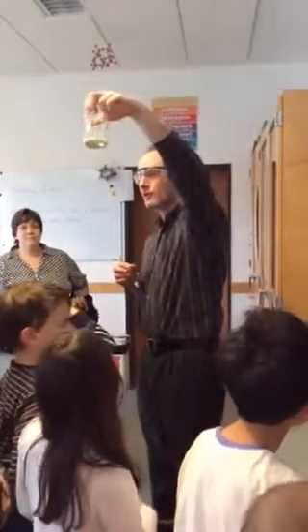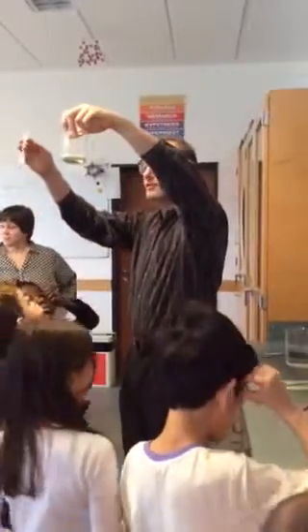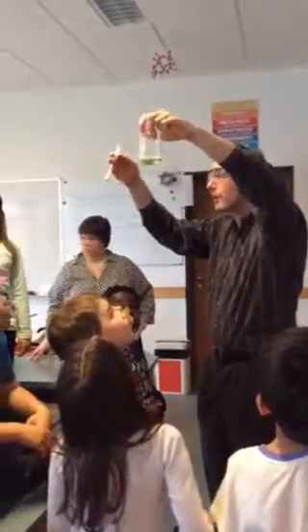This is called sulfur. Sulfur is a very common pure element. And I have a little bit of this sulfur in a test tube. I figure I'd put it in a big beaker so you could see it's nice, powdery yellow.